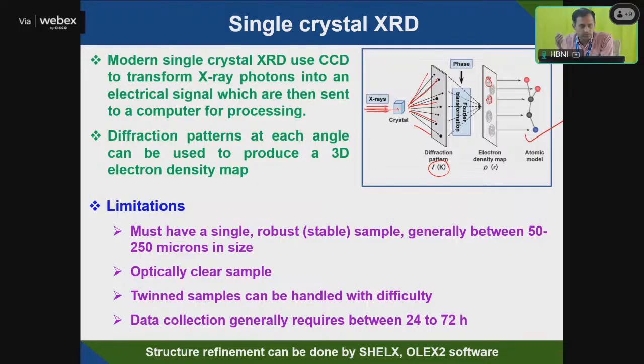Like in some microscopy, the software does it inbuilt. You can do it later on, but you get a better result if you do the Fourier transform inside. Like in FTIR spectroscopy, the Fourier transform itself is done inside, on the interferogram. Similarly it's here also.